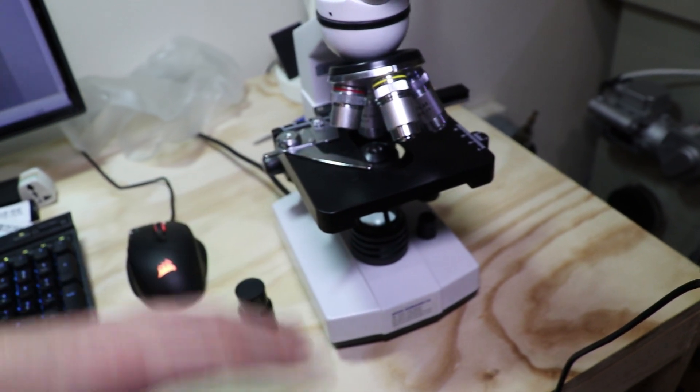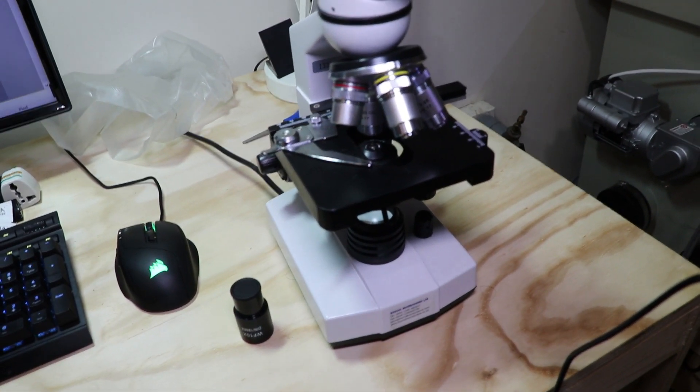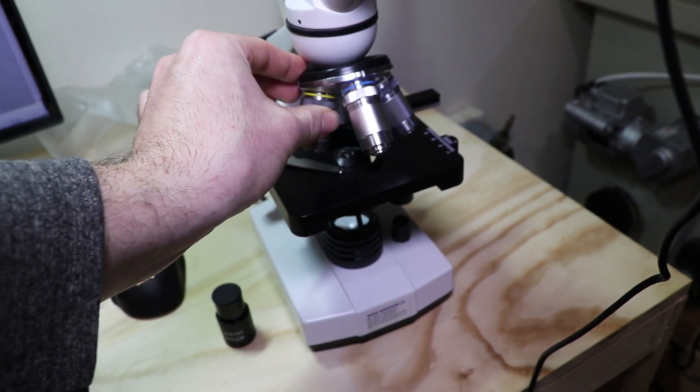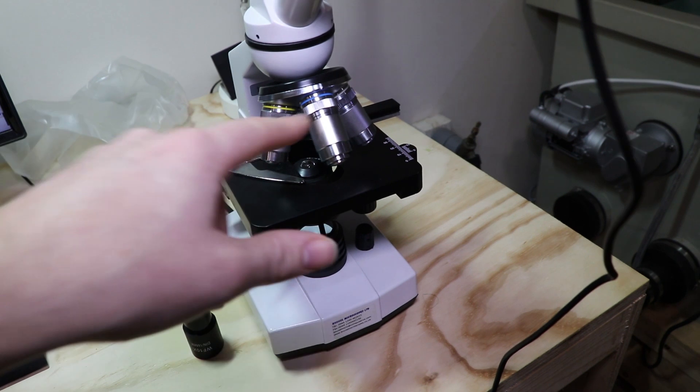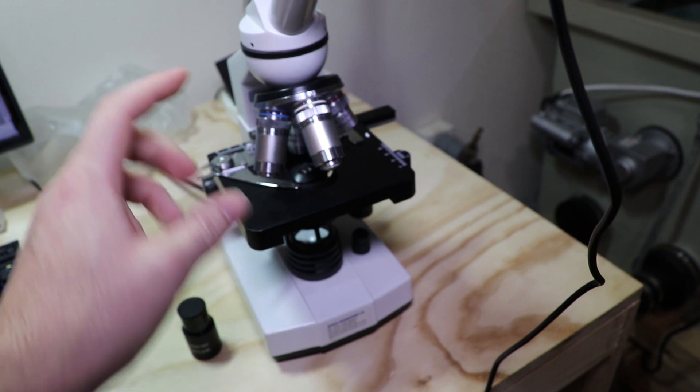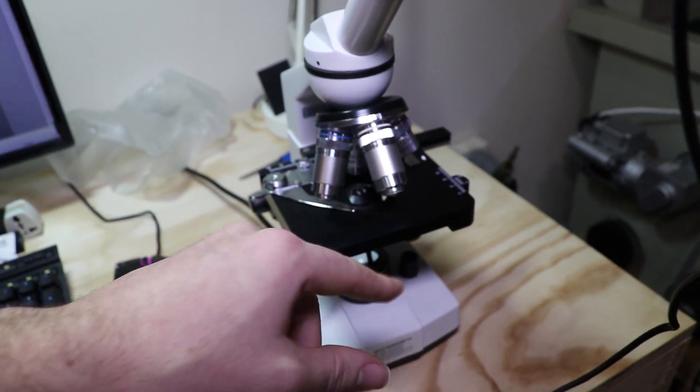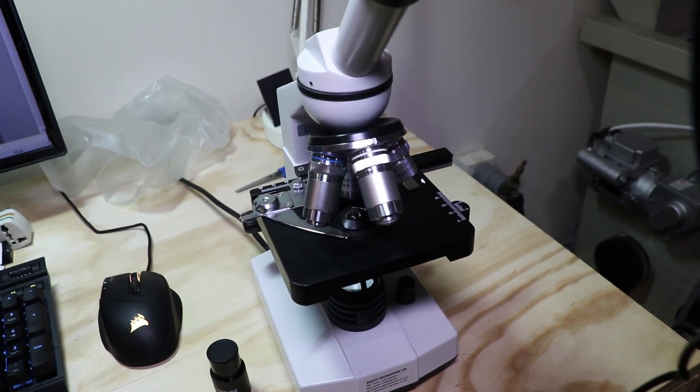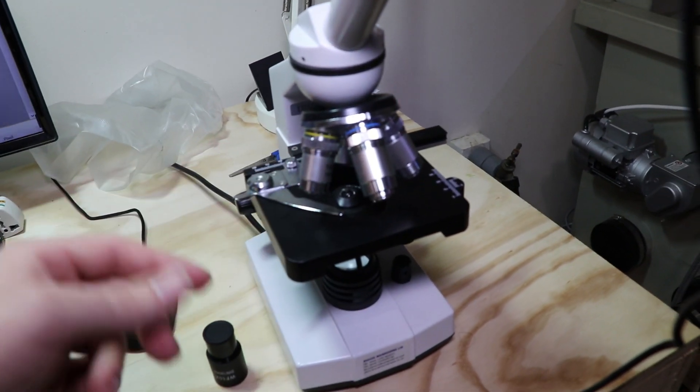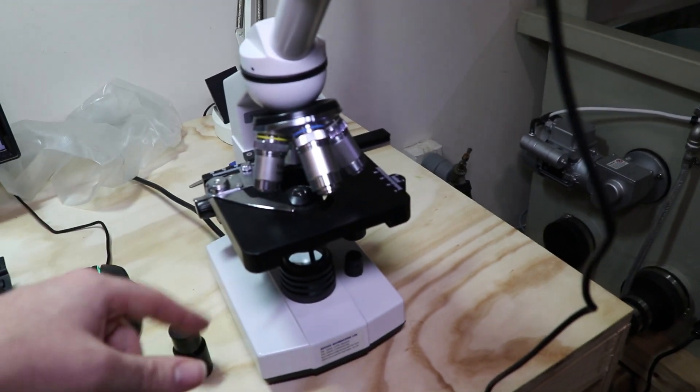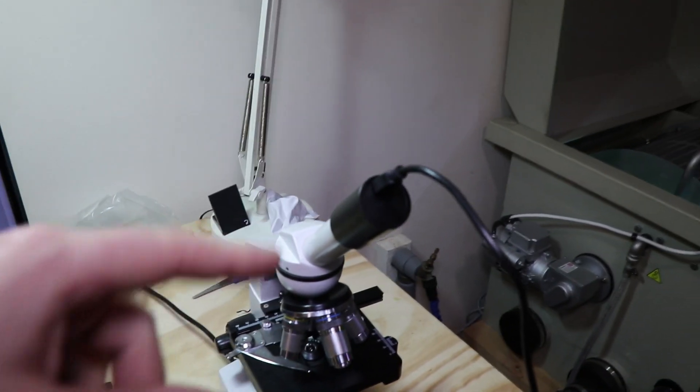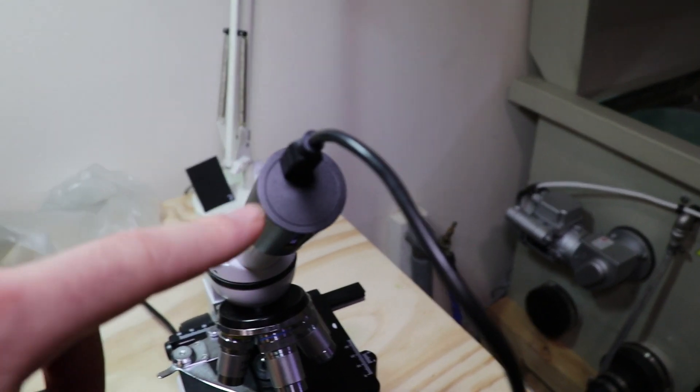Realistically I always use 40x and 100x. 40x you use to have a look around the slide, and if you see any movement then you skip to 100x and have a look at what it actually is that's moving. I will show you 400x and you'll see why it's not really that commonly used. I haven't actually got an eyepiece in it, I'm using a camera.